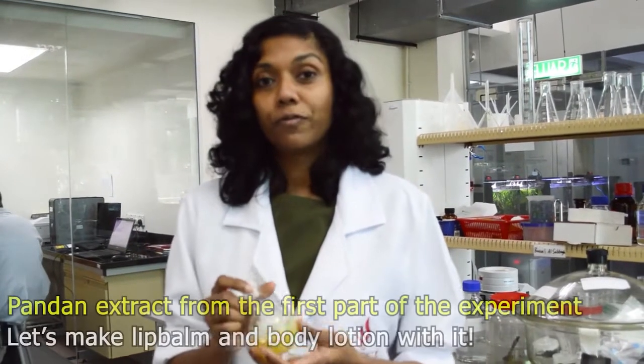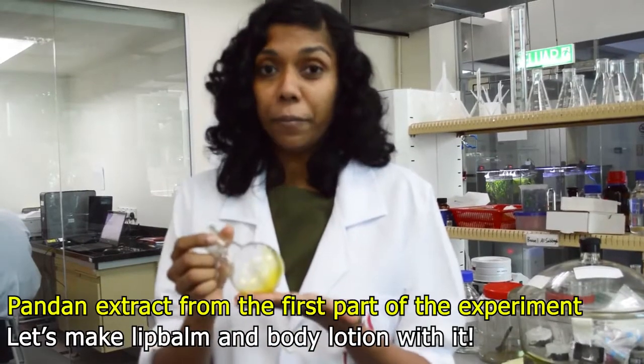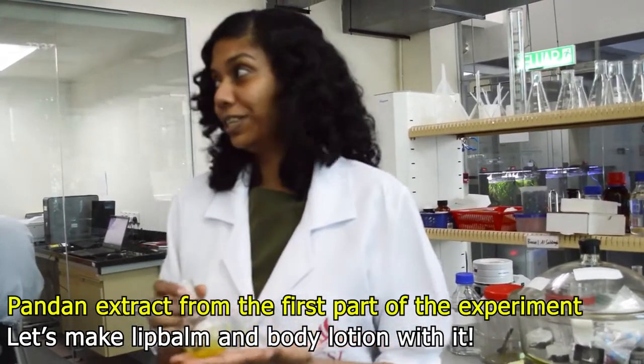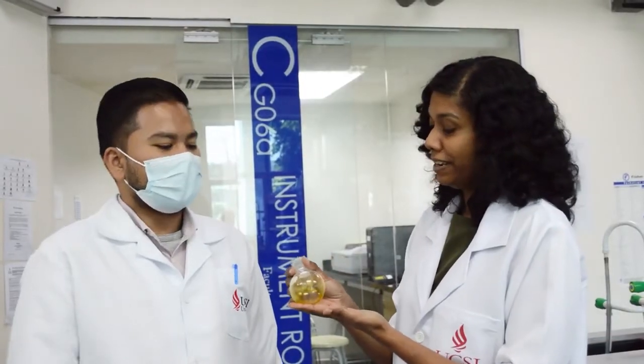Good morning everyone. For the first part of the practical, we've already extracted the pandan compound, and today we'll be making lip balm and body lotion with the pandan compounds. This is the pandan extract. So how do we go about making the body lotion and lip balm?